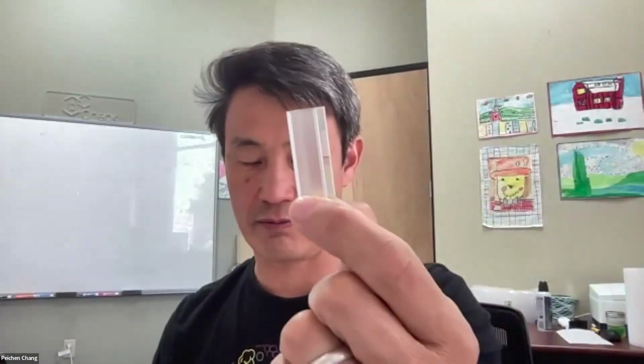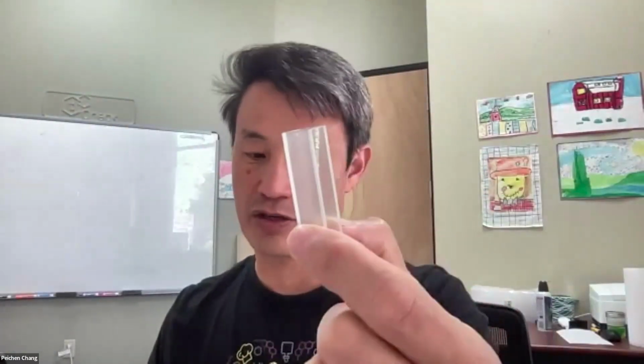It's a lot of distance for the light to travel through for measurement. And these things are basically no good for cannabinoid measurements. If you do want to use this for cannabinoid measurements, you have to dilute your cannabinoid something like 200 to 1 or more before you can even get a signal out.